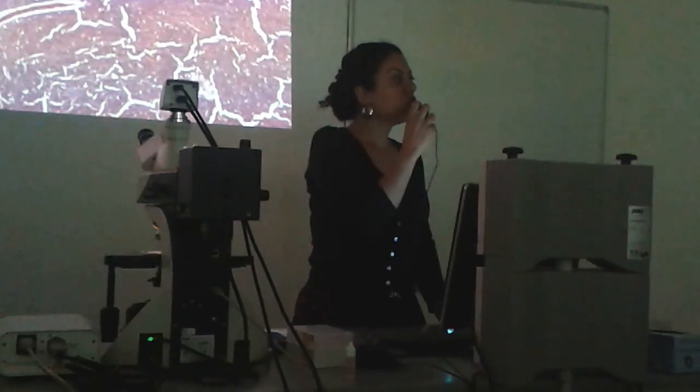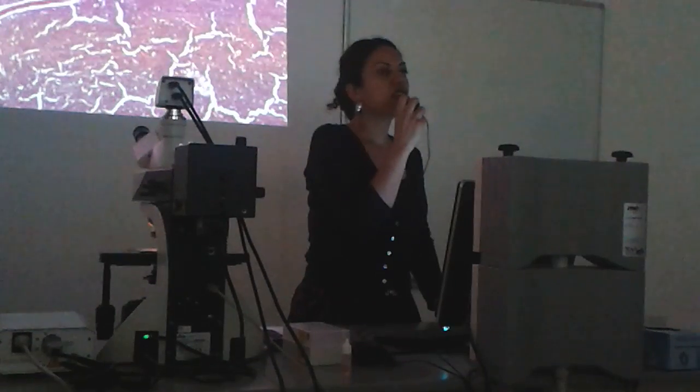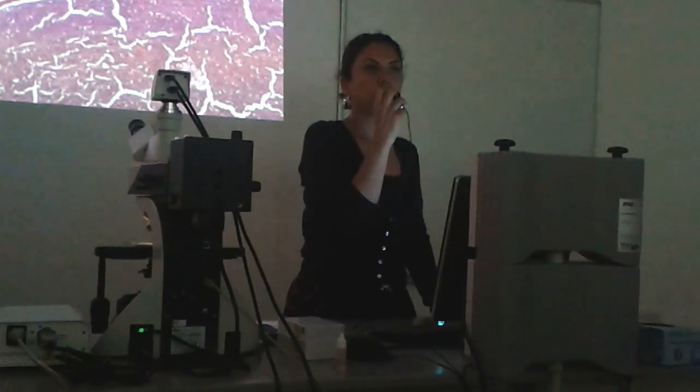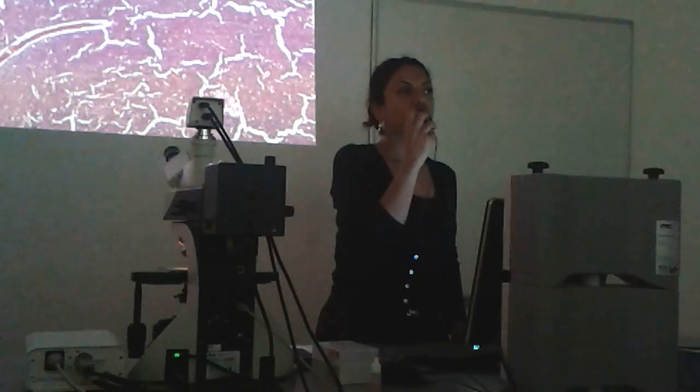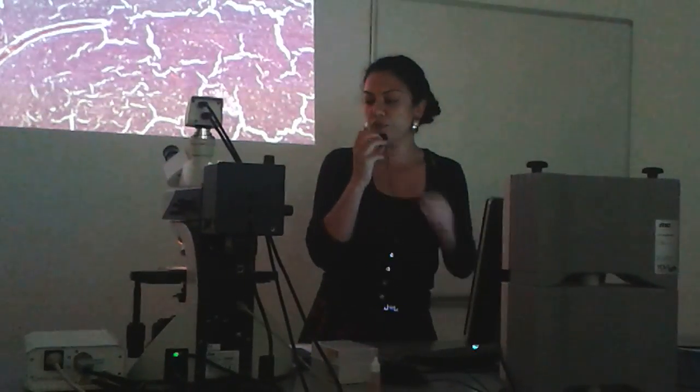And as you have learned, 70% of the brain is composed of cerebrum. So in the first slide, I'm going to show you the histological structures of cerebrum.